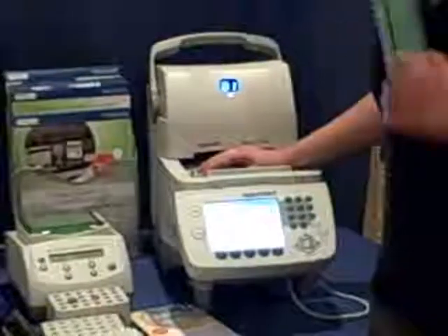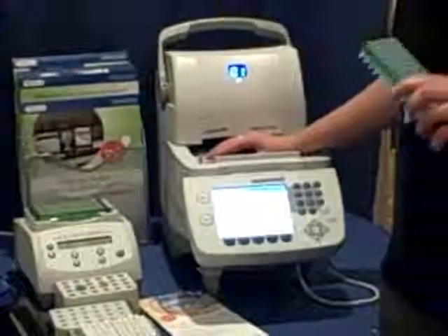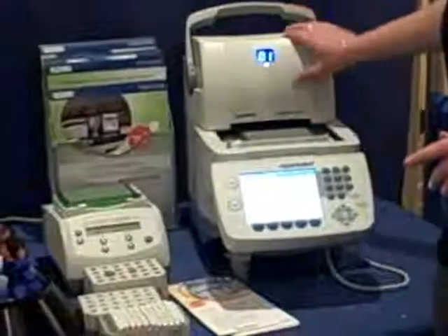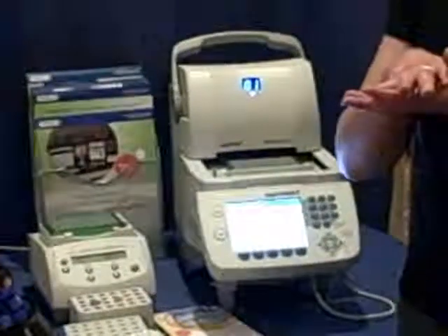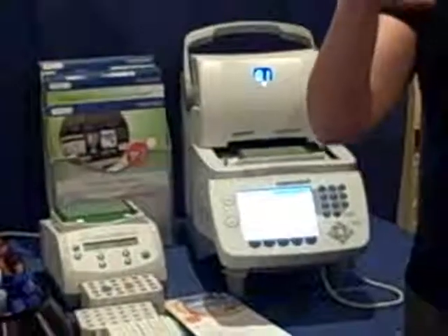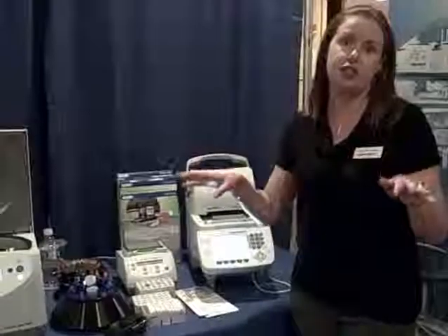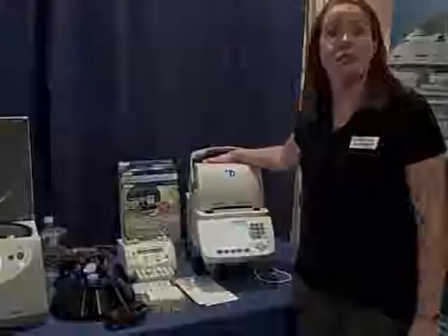You can use any kind of consumables you want — it's a completely open platform. The other great thing about this Cycler is something called Vapo Protect. It's actually like a Teflon-coated gel that's in the heated lid, so that when it heats up, it conforms a secondary seal around your sample so that you get virtually no evaporation. Really unique product and easy and simple to use. Thank you very much.